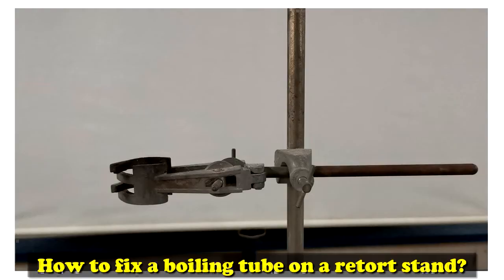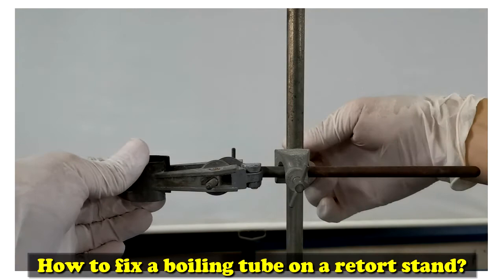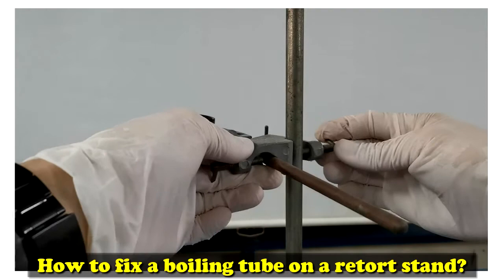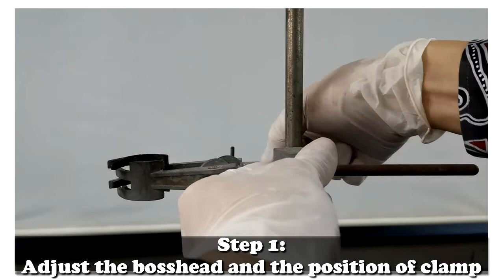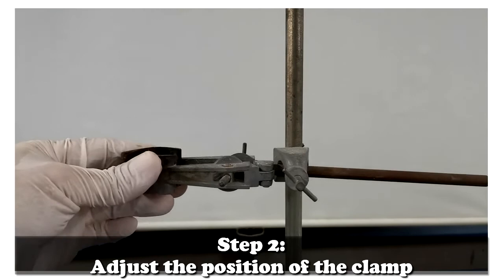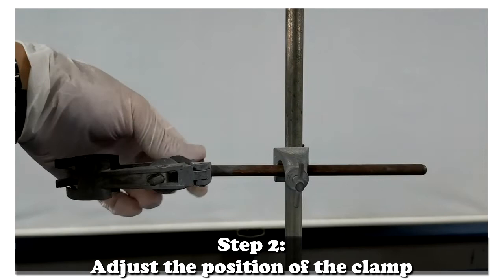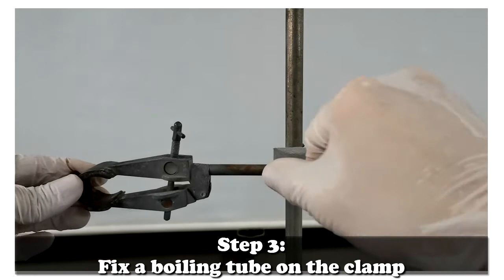How to fix a boiling tube on a retort stand? Step 1: Adjust the boss head and the position of the clamp. Step 2: Adjust the position of the clamp. Step 3: Fix a boiling tube on the clamp.